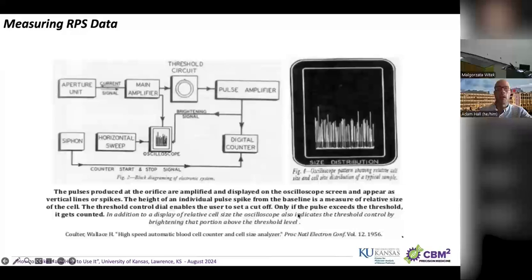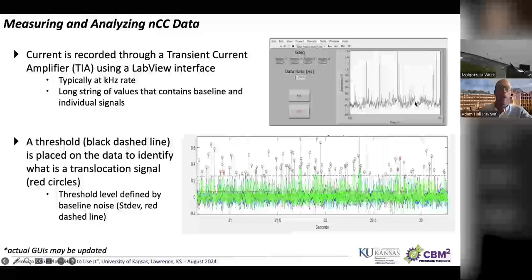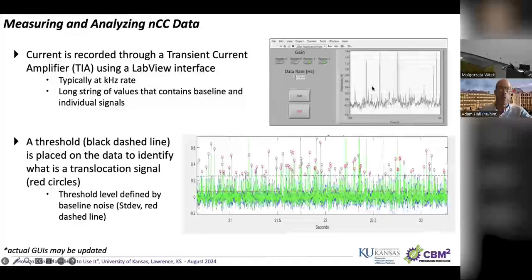This is controlled in the case of the oscilloscope by changing a dial, but we usually do this with some software, right? So you will be seeing, I think, a far updated version of what I'm showing you here. The activity of these software packages is exactly the same, but I think they're a lot prettier now, and so you might see updated versions of these. But essentially, we take the recorded signals that we get, and as you can see up here is how it's recorded, and then we basically do the exact same thing.